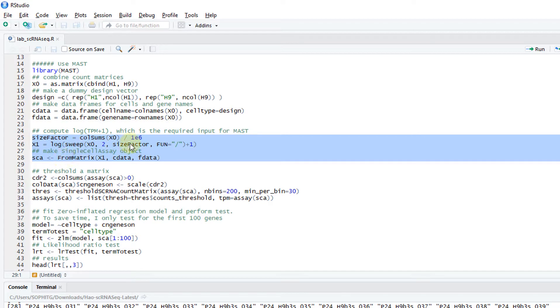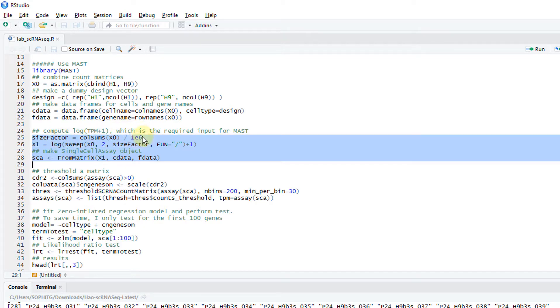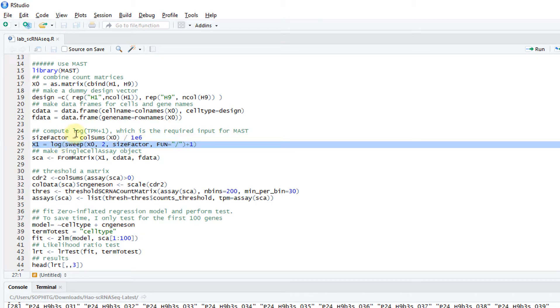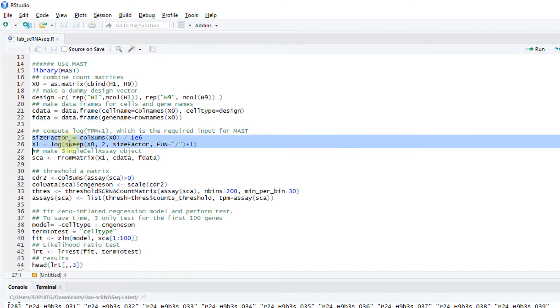Then I compute the TPM value, the transcript per million. Basically use the size factor as the column sums divided by a million. Then this line is used to normalize the data. Basically for each column, I divide by the size factors, then plus one and take a log. So this is the log TPM plus one values. MAST uses this value as input.